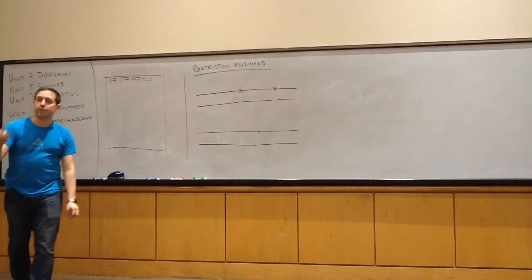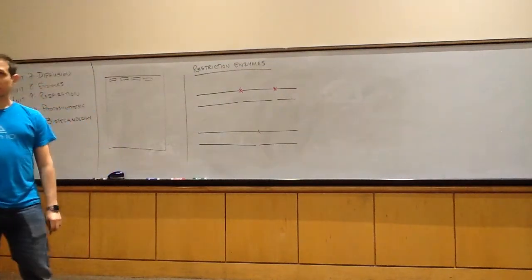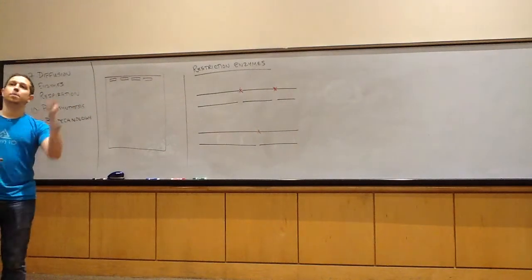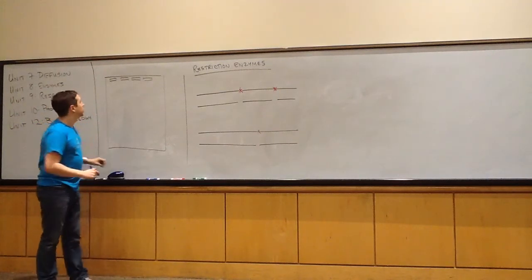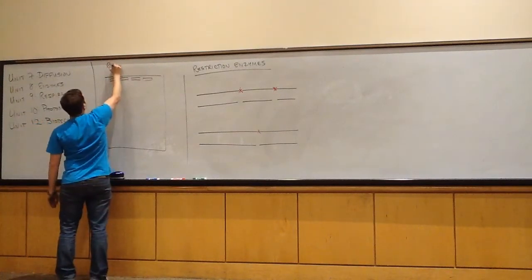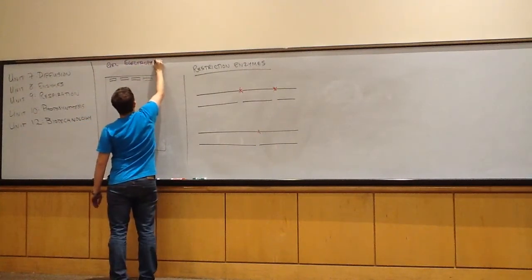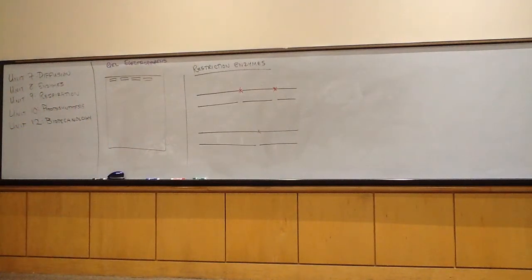We can exploit a very fundamental chemical characteristic of the DNA molecule to get it to do this. It's going to diffuse, and I'll talk about how these fragments diffuse in a second. But if I want to pull those DNA molecules to the bottom of the gel, I'm going to put a current through this gel. That's why we call this overall process gel electrophoresis. Okay? Phoresis literally means the process of moving. Electro means electricity, and gel means gel. Okay?